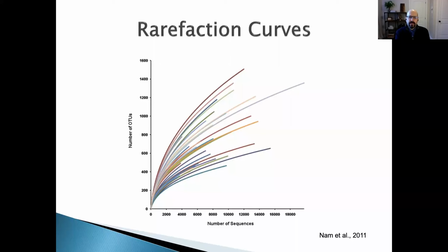you classify them as two different species, or even if you're not classifying them yet, if you're working at the OTU analysis, then those two reads that eventually could be clustered together because they're very similar are still behaving as two different types of reads, and therefore they are classified as two different OTUs. And here you see a huge richness. Sometimes I evaluate studies that found 20,000 different OTUs in one sample of one horse.